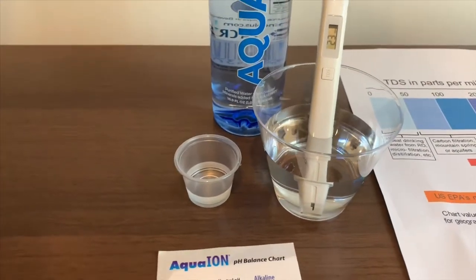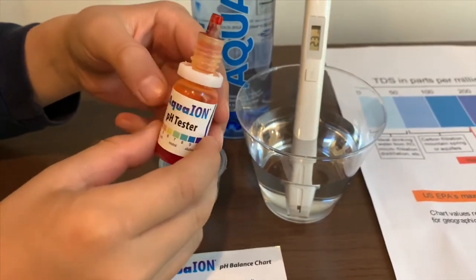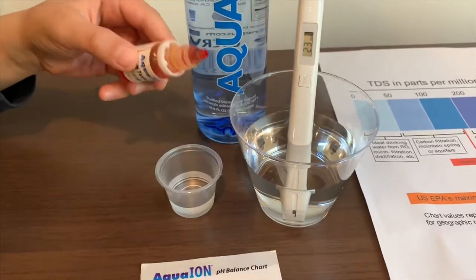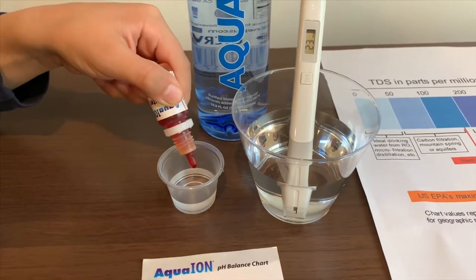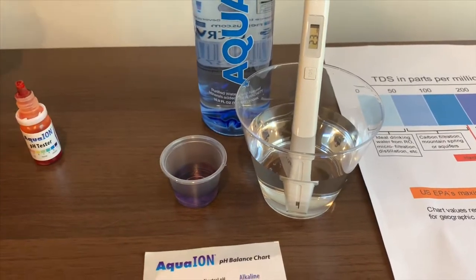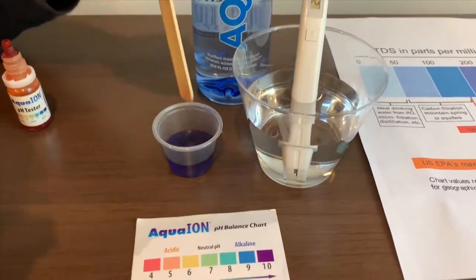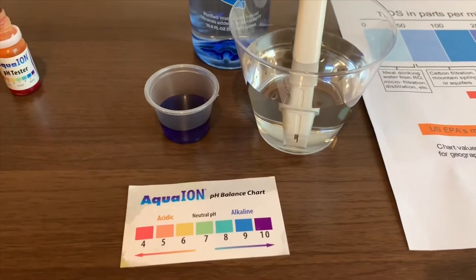Now let's test the pH level. If you want to buy this pH tester, check the link down below. Only do 2 drops. We'll stir it slow so we'll get a better result. I give this a 10 — this is alkaline water.